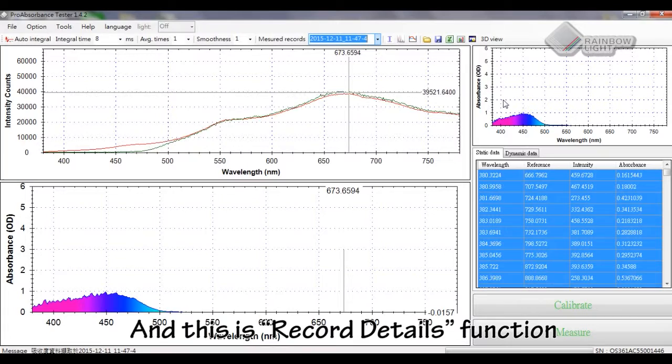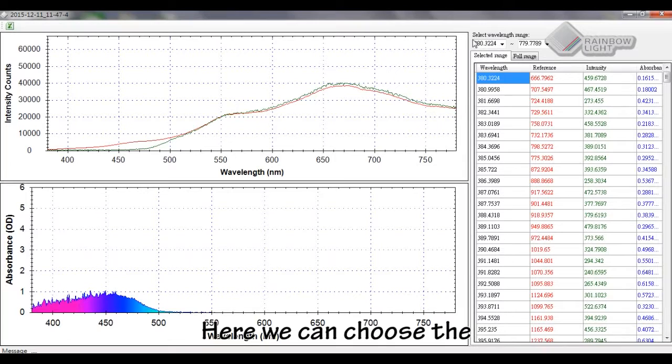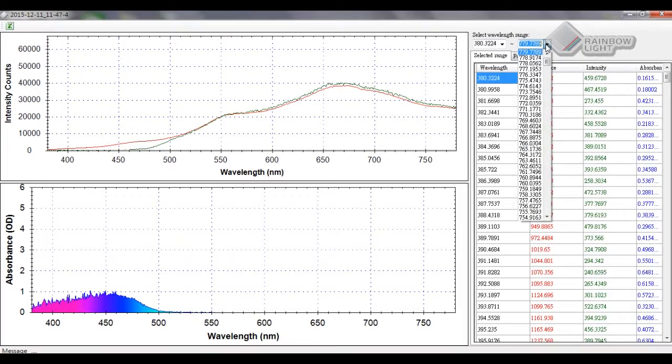And this is the record details function. Here we can choose the specific wavelength range to see the data.